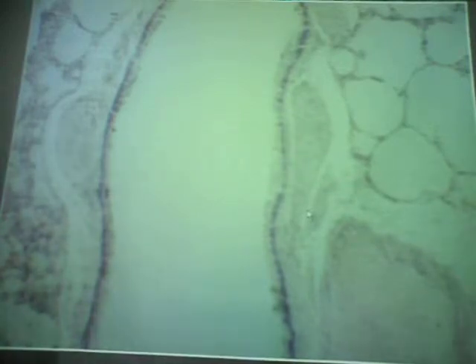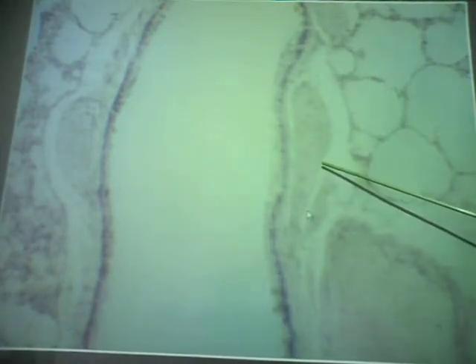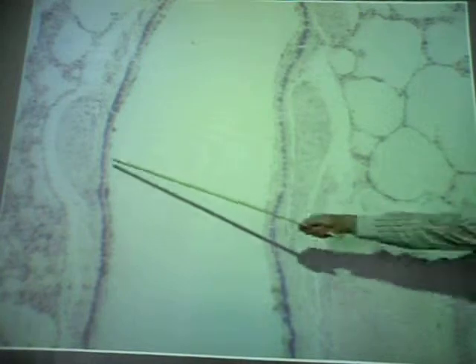Okay. So again, regardless of the size or shape, in these slides, you're not going to see trachea, obviously, unless your lungs get shoved up in your throat. You're not going to have primary bronchi, you're not going to have secondary bronchi, only tertiary. If there's cartilage in the wall, it is a tertiary bronchus. And obviously, as you can see, packs of cartilage here. Now with the smaller one, you're going to have less and less cartilage, but you're still going to see cartilage. So that's cartilage, that's cartilage.